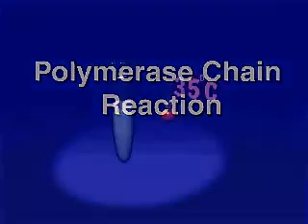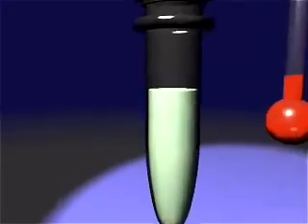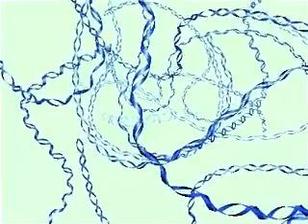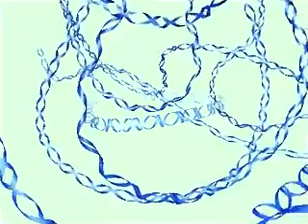The polymerase chain reaction, or PCR, is an alternative to cloning for isolating a DNA sequence. PCR can selectively amplify a single copy of a desired sequence that is present in a complex mixture of other DNA molecules.